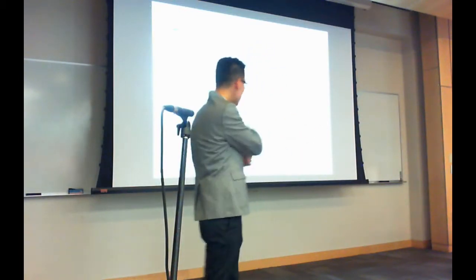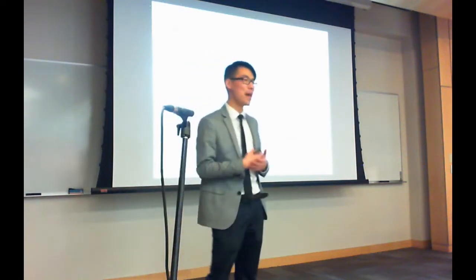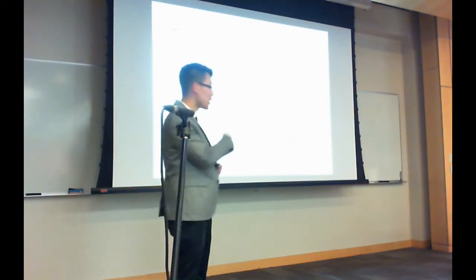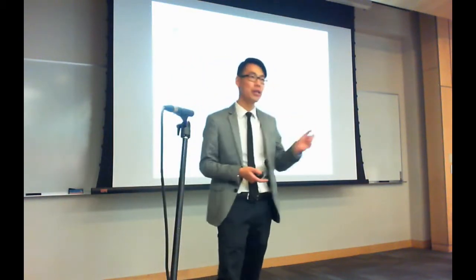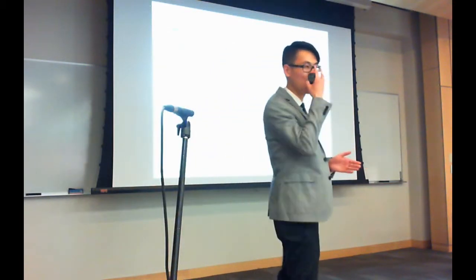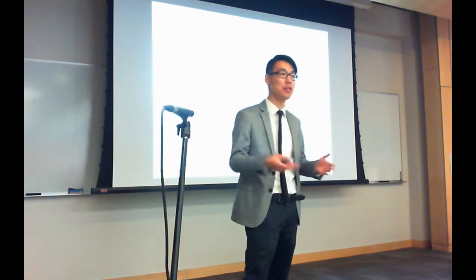With the existing state-of-the-art library from NIST, we see about 77,000 precursors identified. But if we use the new MassIVE-KB library, we see 137,000 precursors identified, an increase of 77%. But where did this 77% come from? 60,000 of these new precursors did not exist in the original NIST spectral library. And so the fact that we grew the spectral library by 4 times made a significant effect on identification rates of this particular data. And so we hope that trend also continues whenever people use our library.